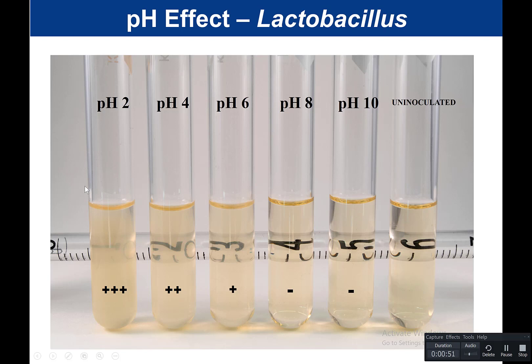The tubes were inoculated with Lactobacillus at pH 2, pH 4, pH 6, pH 8, and pH 10, along with an uninoculated control. We want to quantitate how much the bacteria grew under each condition. We use turbidity as a measurement of growth. To make it easier to quantitate, we take a pipette and stick it behind the tubes, then look at the clarity to read the numbers.